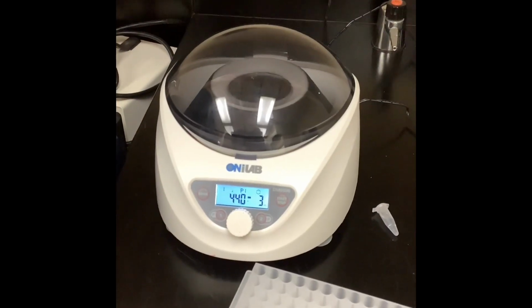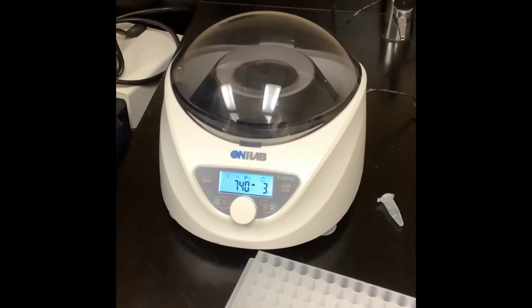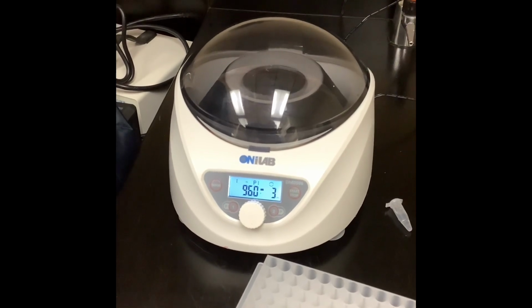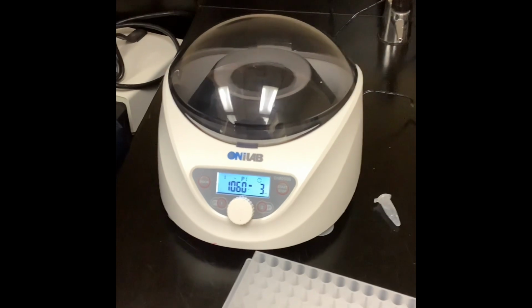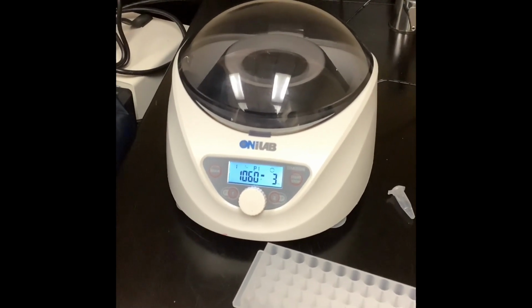So I've removed all of the liquid from the samples and disposed of that in the waste beaker. And then I added 800 microliters of glacial acetic acid into each tube. And now the samples are being centrifuged at 1060 G for 3 minutes.